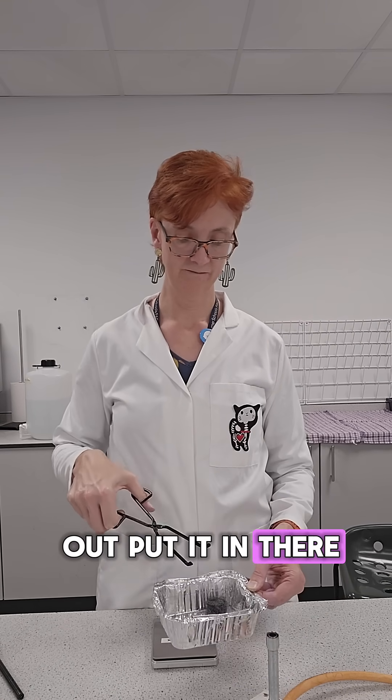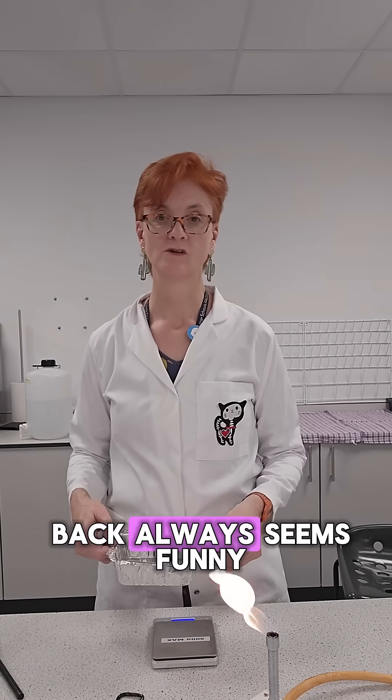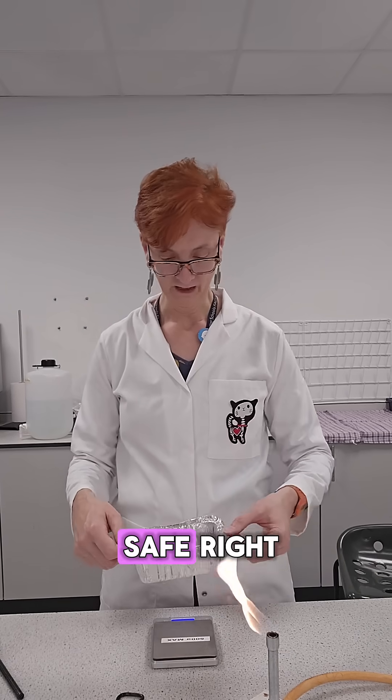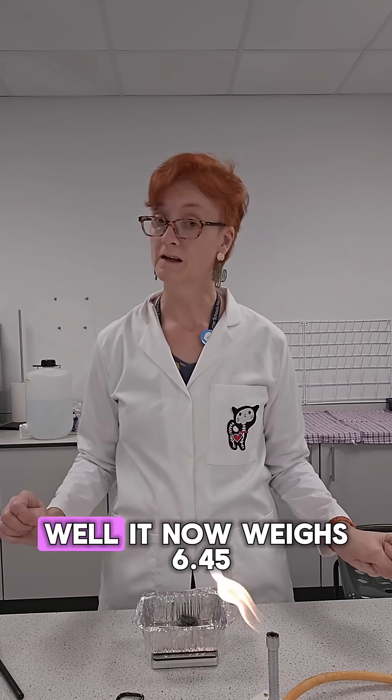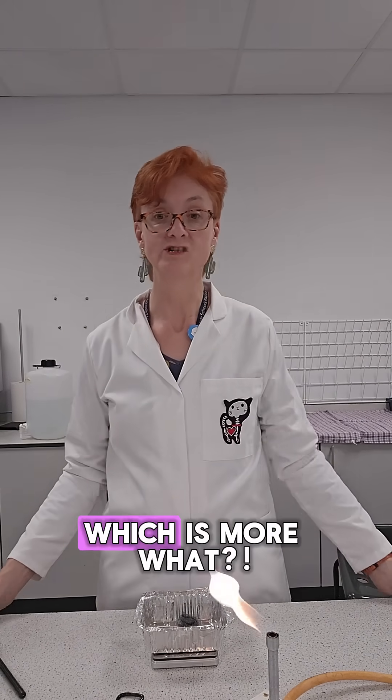Put it in there. Let's see. Safety flame. Back. Always seems funny — safety flame. Flames aren't safe. Right, and let's weigh it. Well, it now weighs 6.45, which is more.